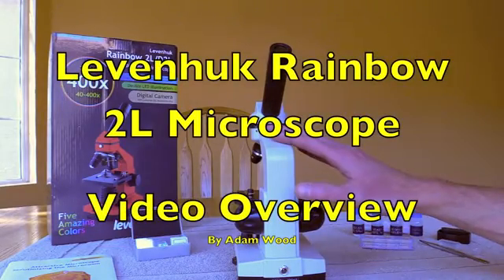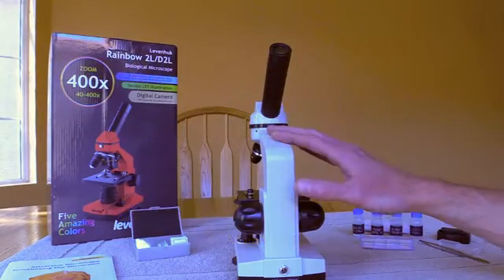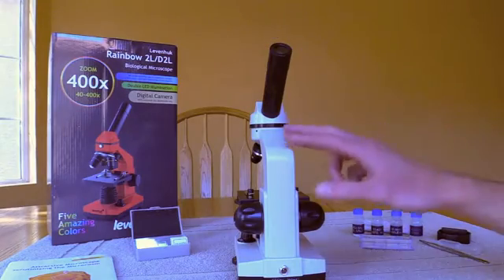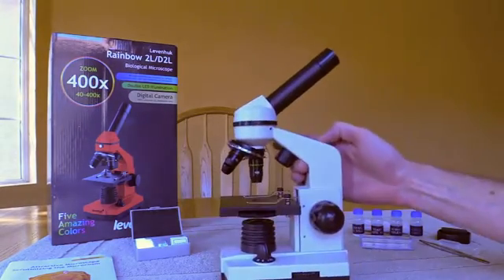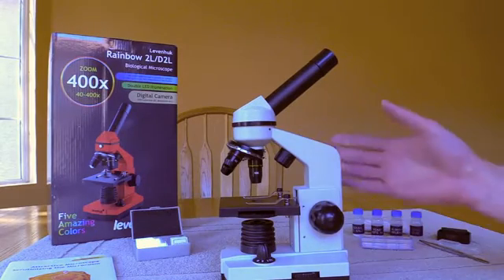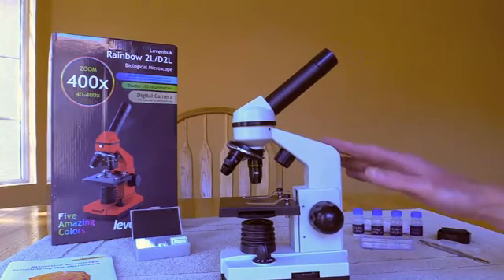Well, hi there. I'd like to show off and give my opinions of the Levenhook Rainbow 2L. There's also the D2L that comes with a digital camera. You can see it listed there on the box. This is the 2L model that doesn't come with the camera. It comes in five different colors. This is their Moonstone color.